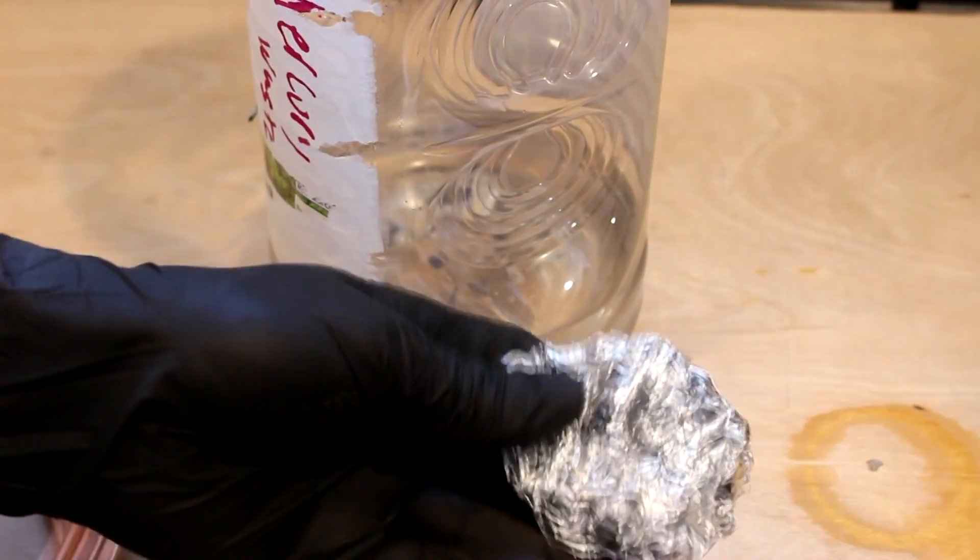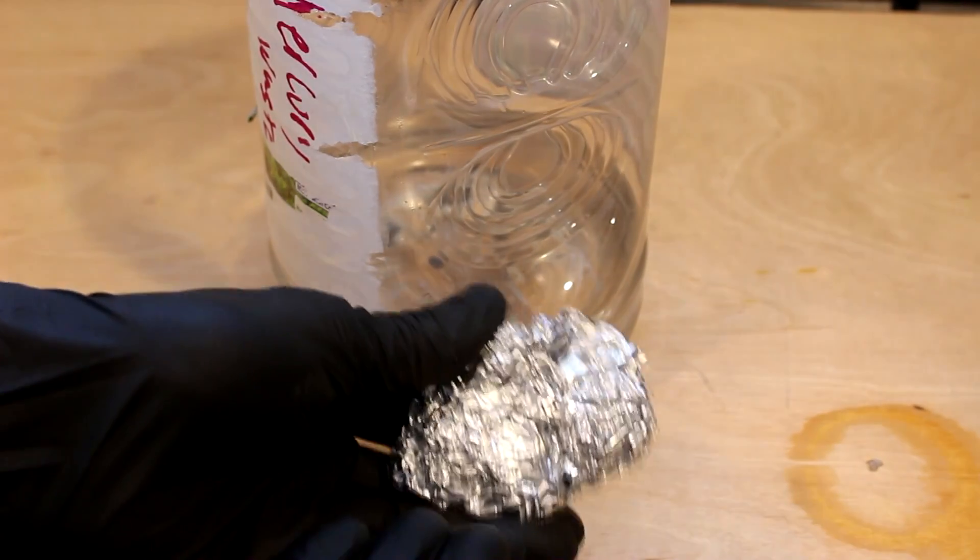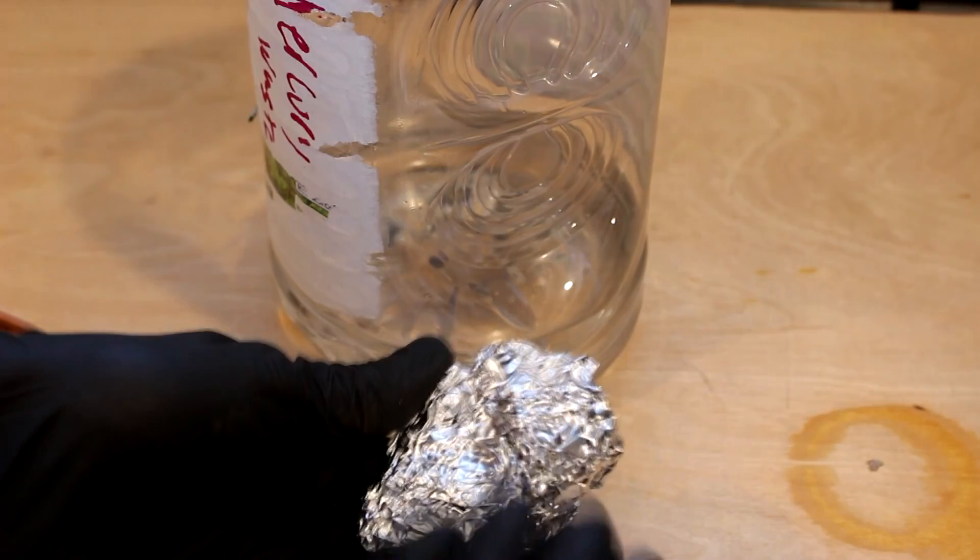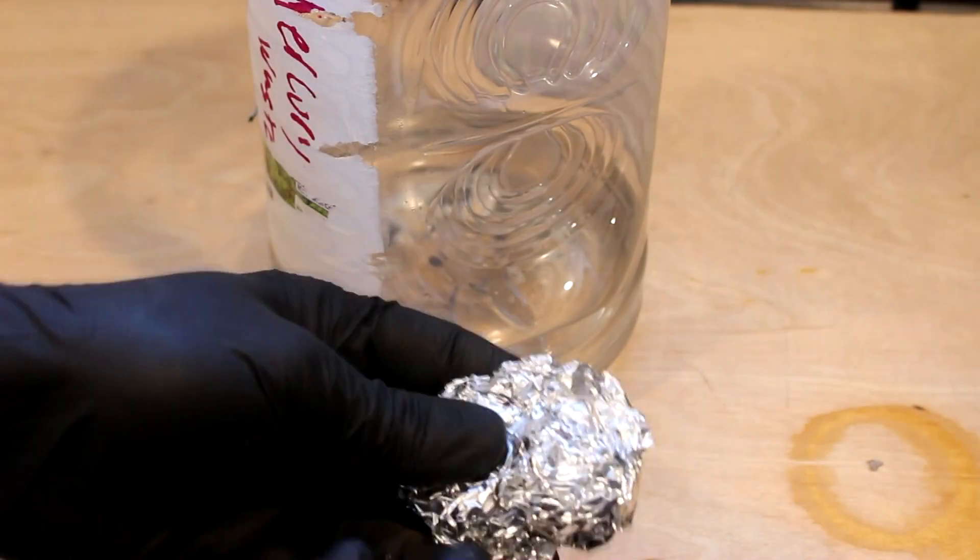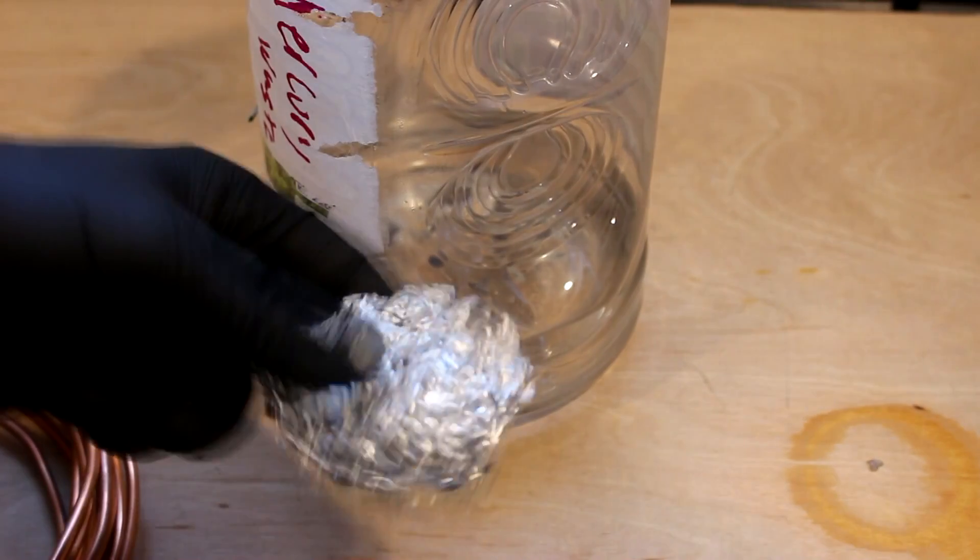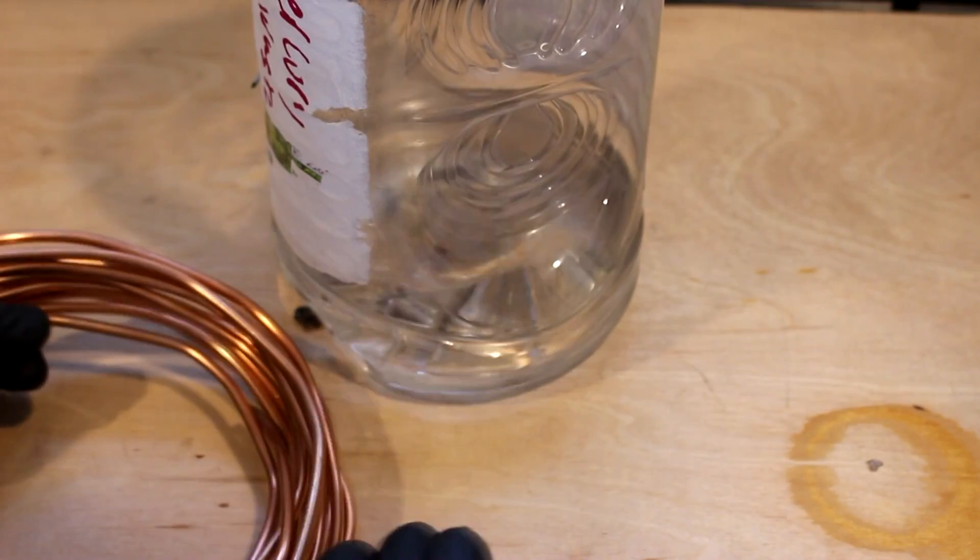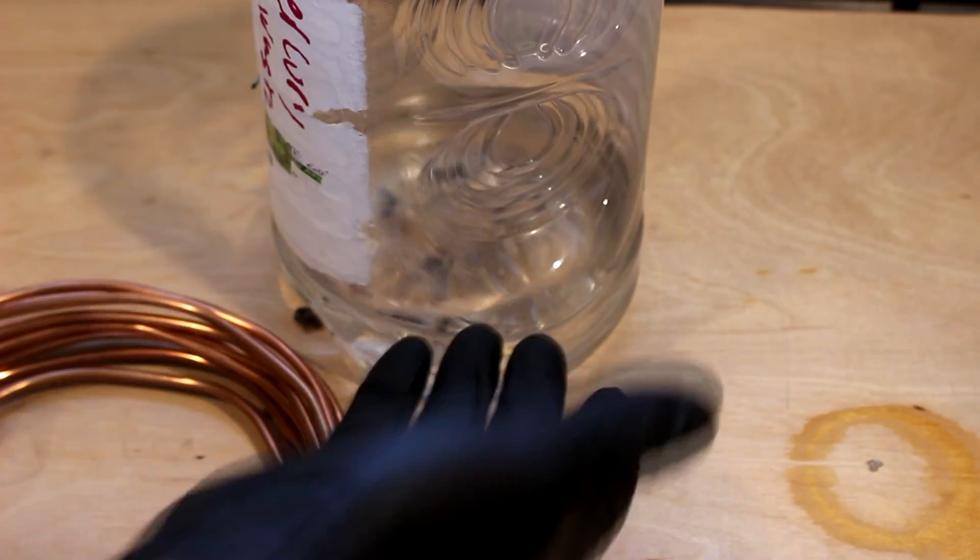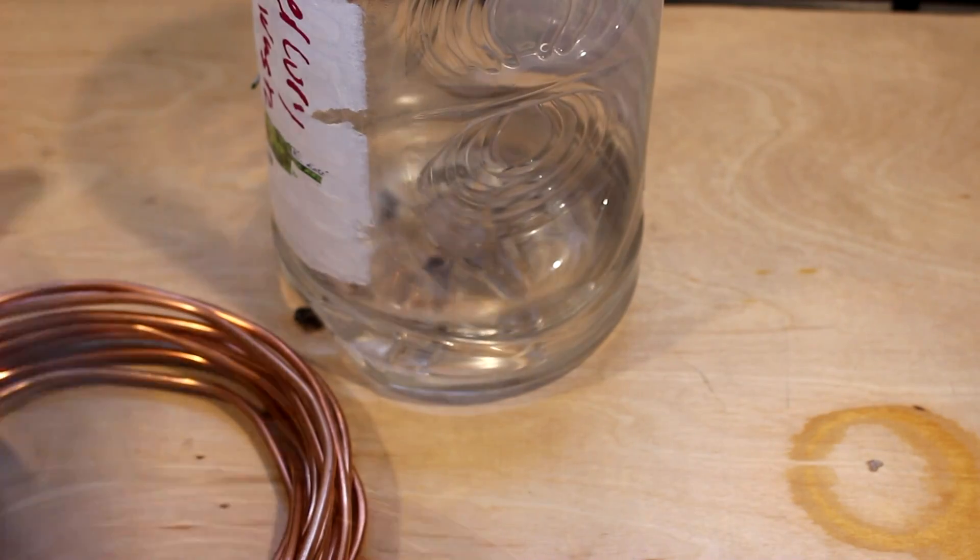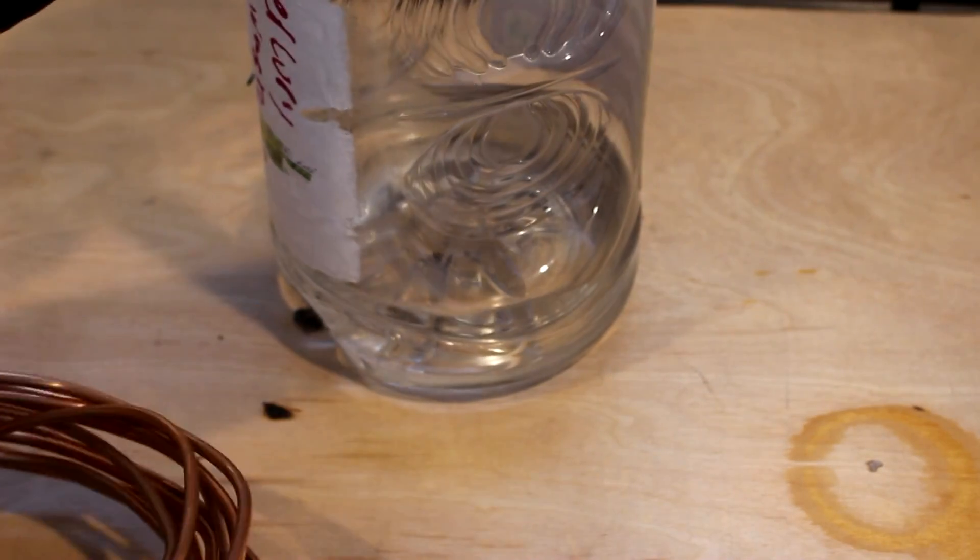Aluminum will not. The aluminum can actually react with hydrogen in the water, or dihydrogen monoxide, forming hydrogen gas and aluminum oxide. Normally aluminum does not replace hydrogen because of a passivating coating of aluminum oxide, but mercury of course disrupts that. So you may see a small amount of mercury metal form but the aluminum will react with the water and be quickly consumed. Thus the efficiency will be incredibly low. But if you choose the right metals you can be very selective as to which ones you replace.